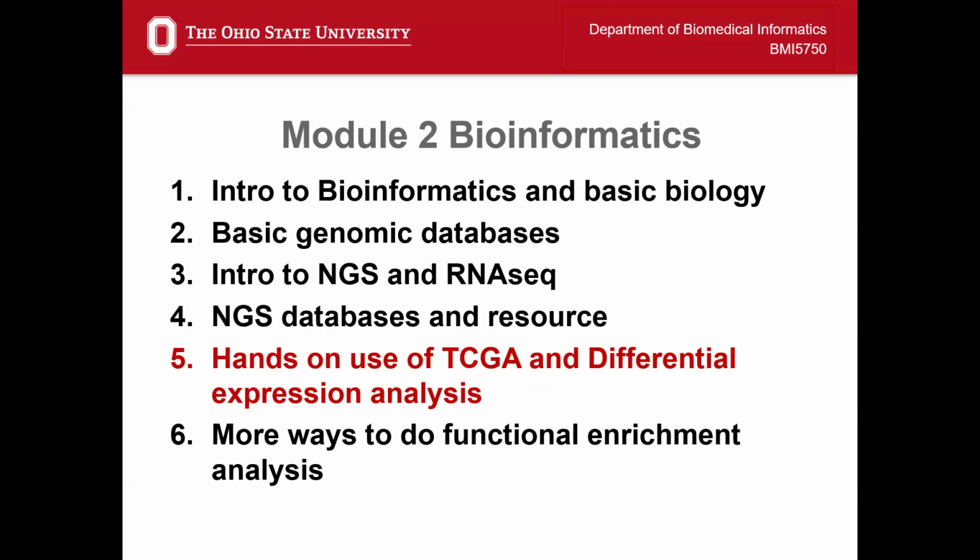That's the parallel aspect of the sequencing. And it made so many of those short reads. That's the high throughput aspect. And we learned how we could take a bunch of different samples, tack on little barcodes, and pool them together so that after we sequence, we can separate those barcodes, those samples out, and have separate sequences.